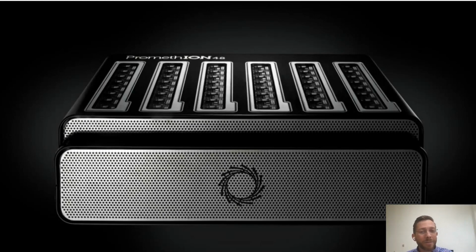Now, a single flow cell can sequence about 150 gigabases worth of data. So this is about 30 to 40 times coverage of the human genome in 48 hours. But when we take our sequencing library and distribute it over 48 flow cells and sequence all 48 flow cells simultaneously, we can get that same genome coverage within 2 to 3 hours. So this device really enabled us to sequence at an extremely fast rate.